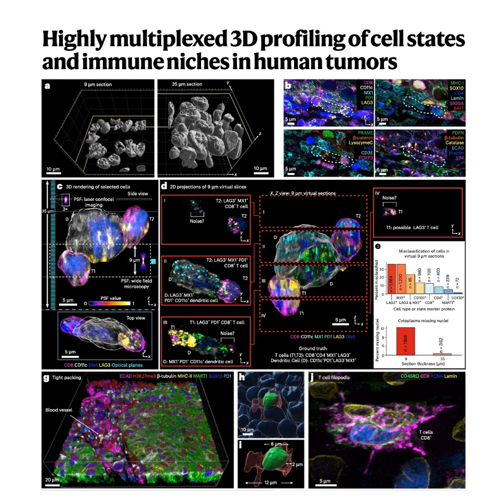And then there was type 3, which sounded more like a neighborhood gathering. They mentioned complex immune cell clusters they called lymphonettes. Right. Type 3 neighborhood clustering involves looser packing. The cells are still relatively close, with membrane separations around 500 nanometers or so, but the contact area is typically smaller, maybe just 1 to 2 square micrometers. What they observed were these complex networks or clusters involving multiple immune cell types, T cells, B cells, dendritic cells, all loosely interacting in these lymphonettes. They provocatively suggest these might represent the very earliest stages of formation for something called tertiary lymphoid structures, or TLSs.